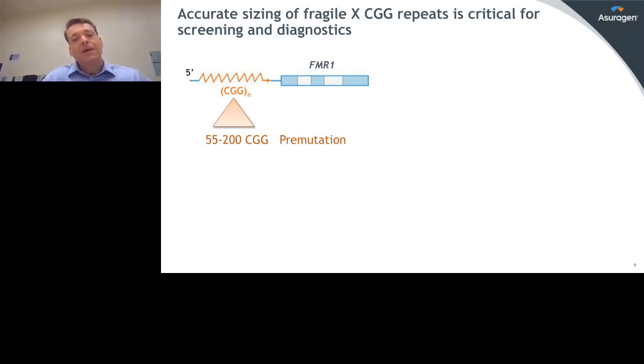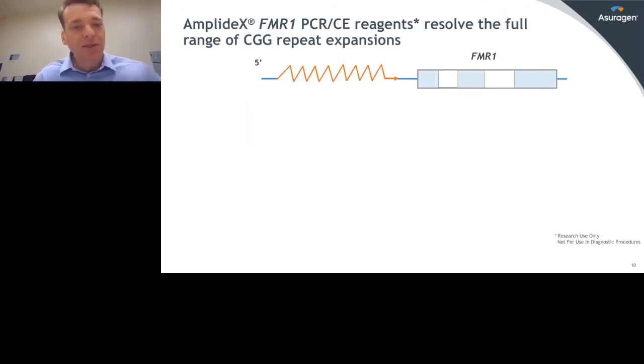And then finally, in the case of premutation women who are at risk of transmitting a premutation allele that can expand to a full mutation in the next generation, it's important to accurately size the CGG repeat, because even a plus or minus 2 CGG difference in premutation women can translate to a 20% differential risk for expansion in the next generation. So you want to make sure that you get that right. So the question is, how do we do that? How do we deal with the fact that this is a CGG repeat expansion? By definition, it's 100% GC. How do we deal with the fact that we need to identify more than 200 repeats of these?